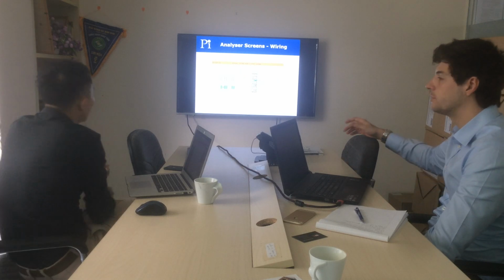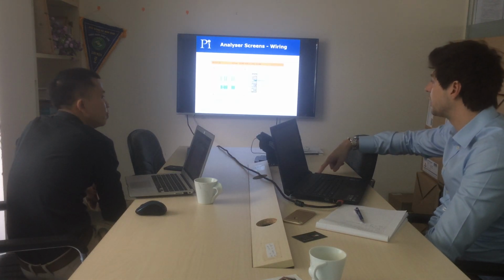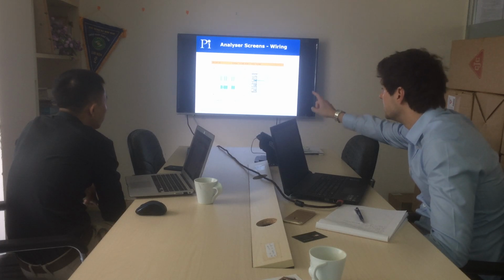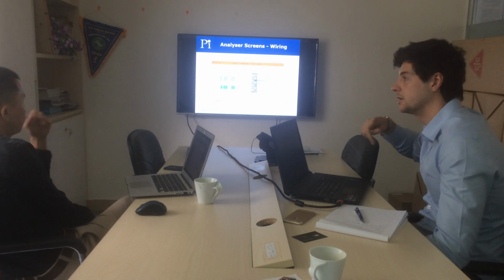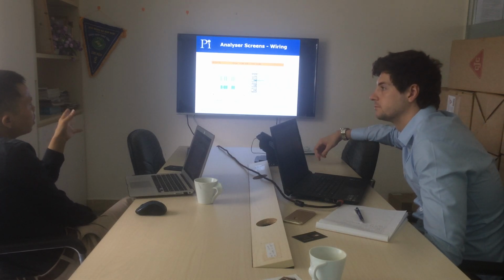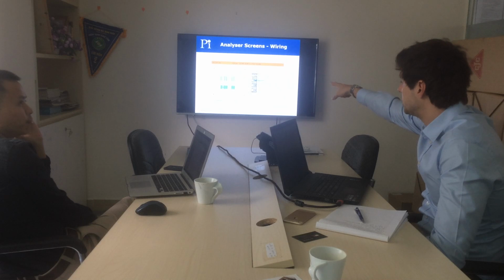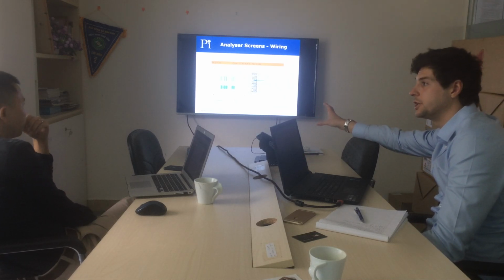We also have useful information for the wiring for engineers. There's a connections page which shows here the second slot is highlighted, which means that these wires need to go in the second slot. There's a number of cards in the analyzer, and this one shows it needs to go in the second. The principle is the same with the other analyzers. And then it shows you which wire needs to go into which hole. So this is really useful for engineers.